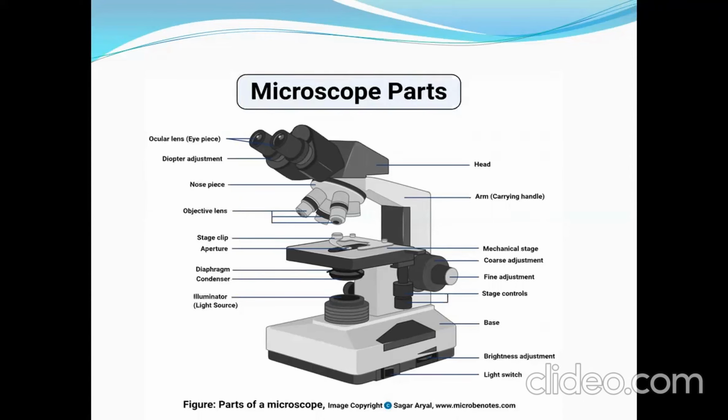Can you get the point? So this is the magnification range or limit of the compound light microscope, which we are using regularly in our laboratory. Okay, so just read out this portion.